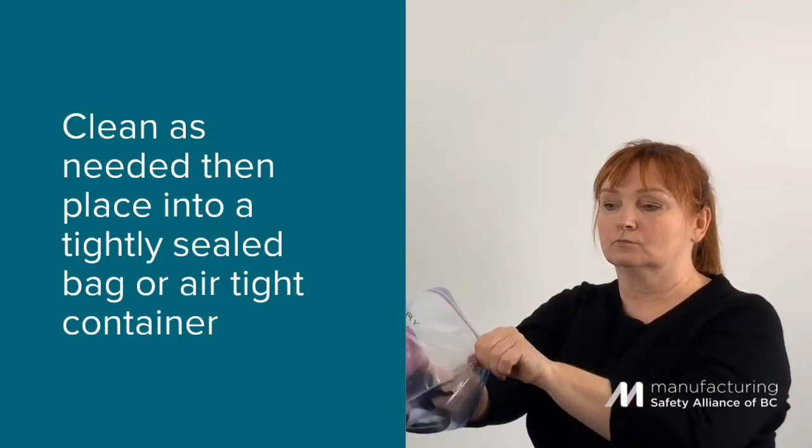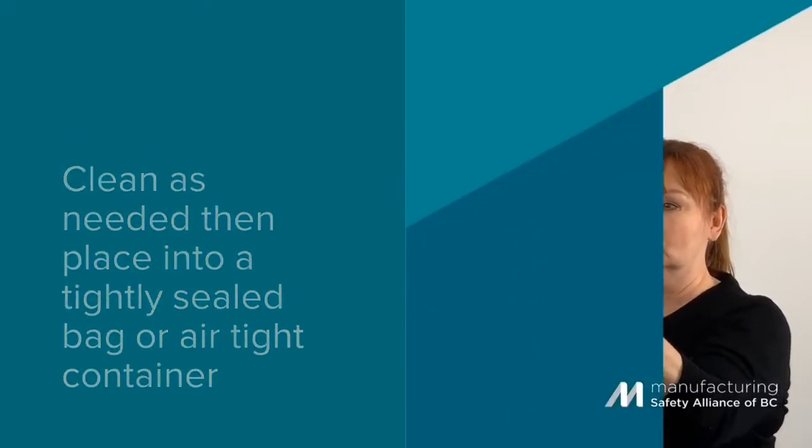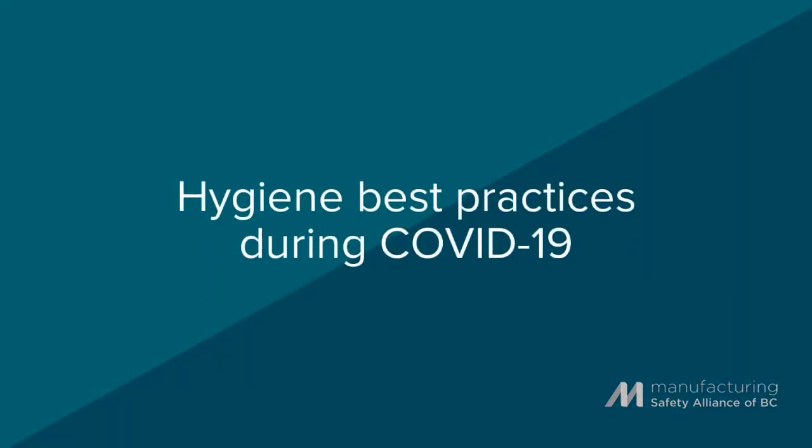Clean your respirator as needed and place your respirator into a tightly sealed bag or an airtight container. During the COVID-19 pandemic, it's especially important to wash your hands before and after donning and doffing your respirator and avoid touching your face.